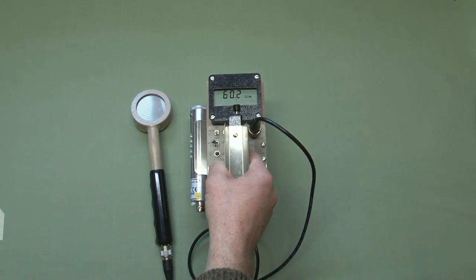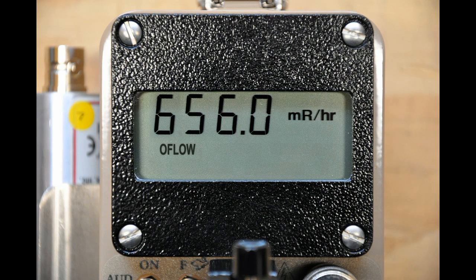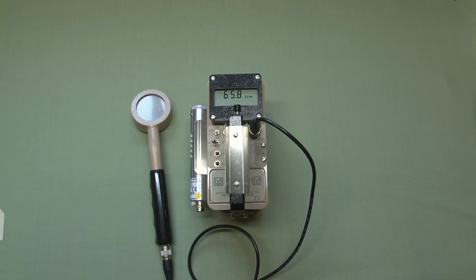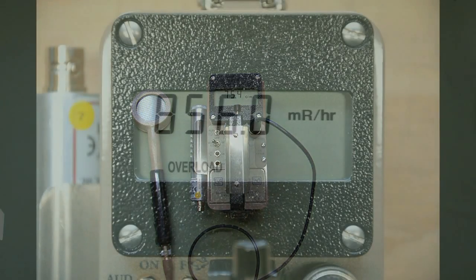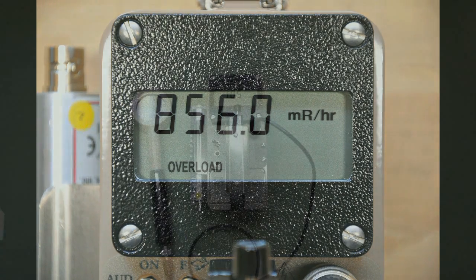The instrument also has a count overflow visual alarm indicating that the counting circuitry is near the maximum counting capability. When this occurs, the word 'O-FLOW' for overflow will appear on the display. If the detector is being exposed to radiation intensities greater than that detector's maximum operating limit, the word 'OVERLOAD' will appear on the display. It's important that you watch for these visual alarm warnings when you're using the instrument.